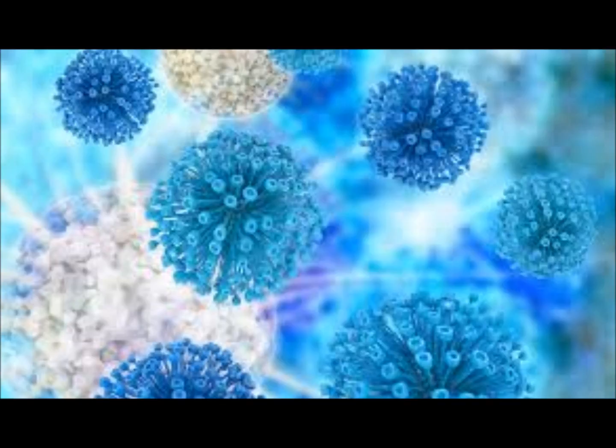So on the setup bench, you may need to write descriptors of what your specimen looks like. If they want to know if that sputum looked green and purulent, did it look bloody and full of mucus. So macroscopic will vary on what your site. So we will build to that come to the end, okay? You're going to mainly get your experience with real specimens at the actual clinical.